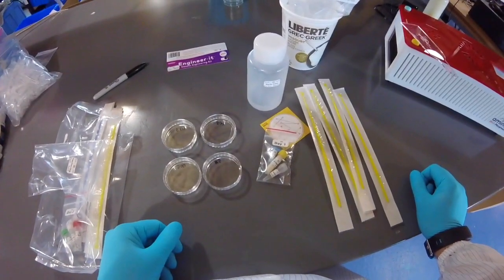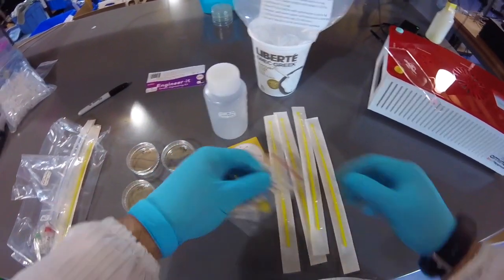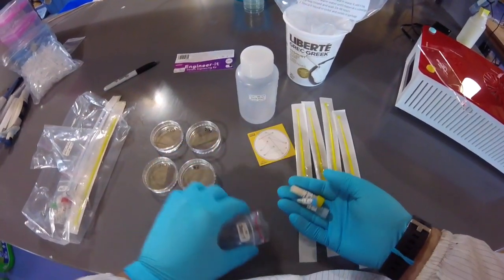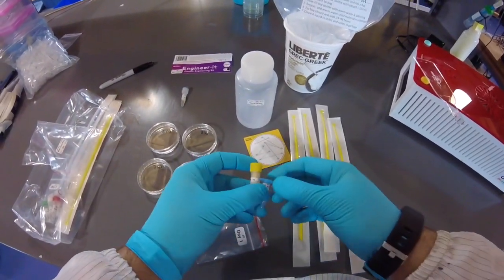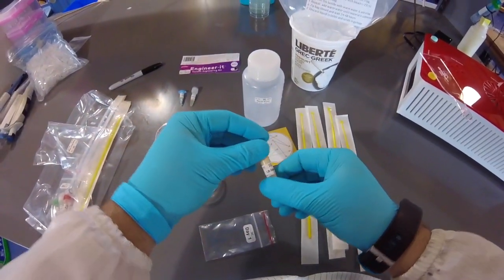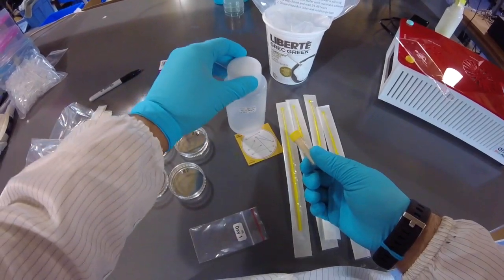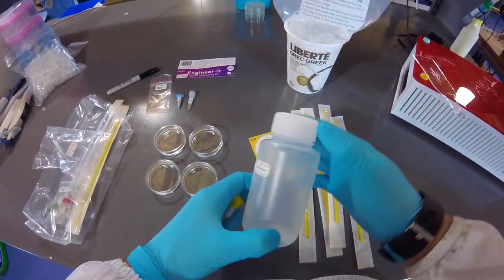And now we can go ahead with creating the LB agar to pour into those, okay? So for that, we don't need the cells right now. We'll need those in a little while. We can even leave the antibiotic here. But we are going to need this powder, and we are going to need this water. I'm just going to put that to the side, and so we're going to go to the microwave.